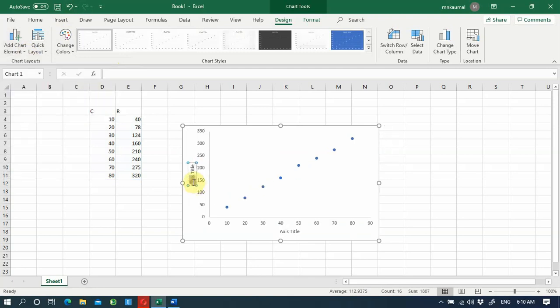Now you can rename these. When you are doing this, you really need to be careful. You can write concentration. Or let's say this is not the concentration, this is the absorbance. If there's any unit, you need to write the unit. So how do you write the unit? You write a slash and then whatever the unit. So let's say if it's current, you can write amperes. It can be milliamperes, so you can write the unit.